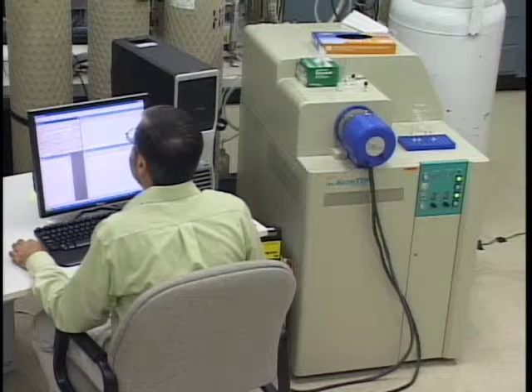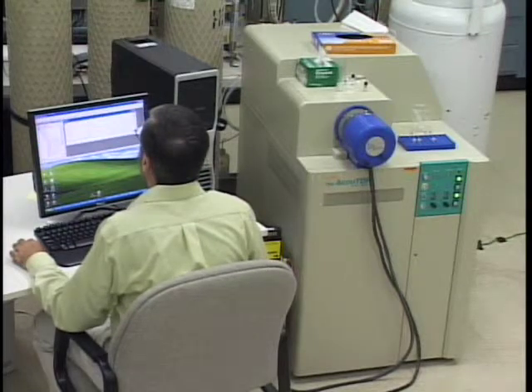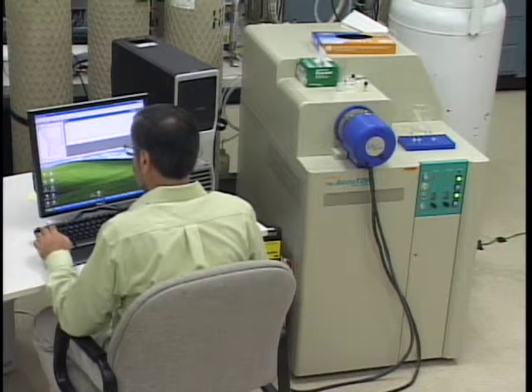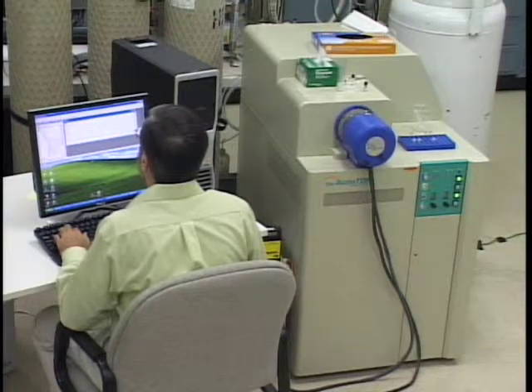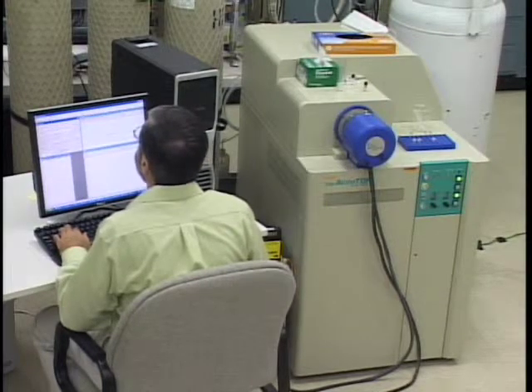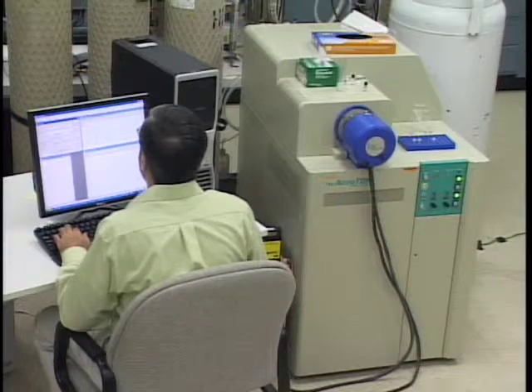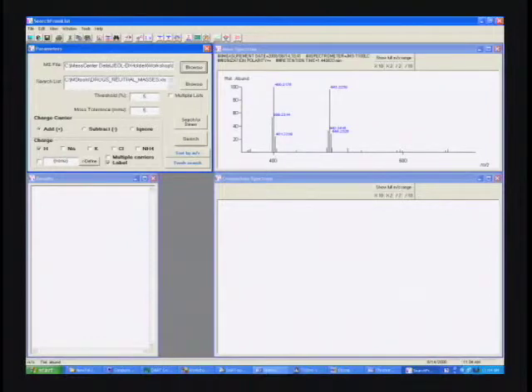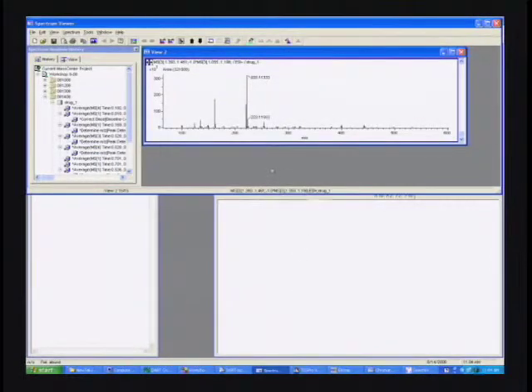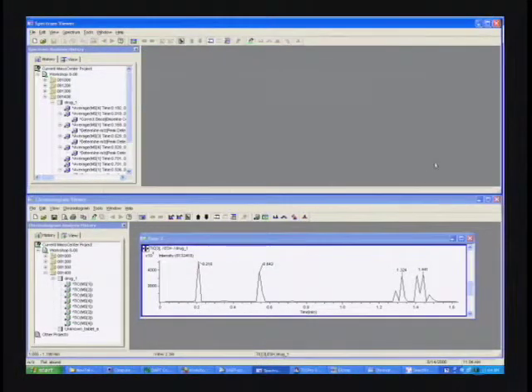That's still not the correct one, this not being my instrument here. Try to replace that one more time. That one opens correctly, and that one it does not. Try this one more time.